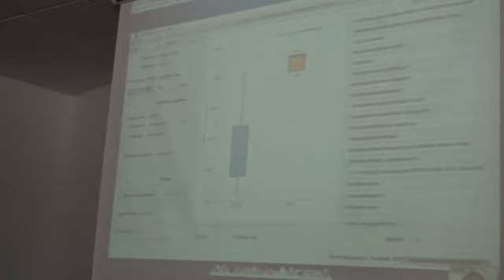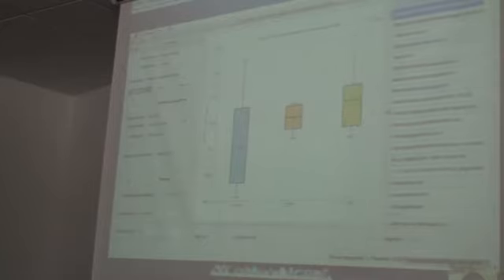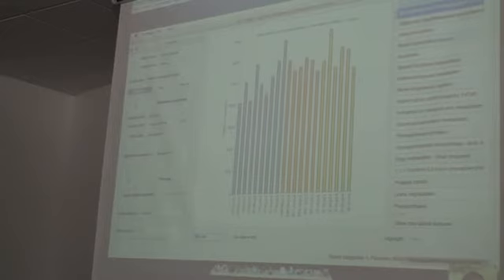So we have at the top biosynthesis and biodegradation of secondary metabolites. And this is our box plot, again showing the number of sequences. We can do the same sort of plots as before. We can do a bar plot based on that. We can also do a PCA plot. So this is a PCA plot based on the functions. And as you know, this isn't really as informative as the OTUs, and that's kind of to be expected because it's well known that we often see more functional conservation as opposed to OTU variation, especially at the pathway level.